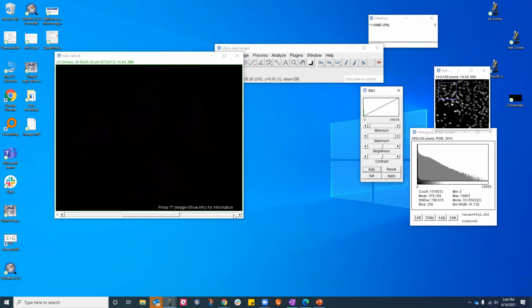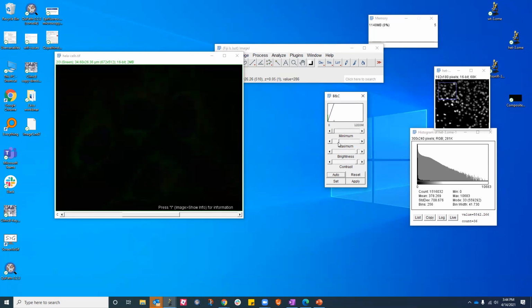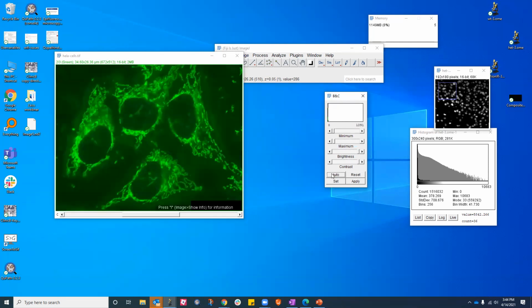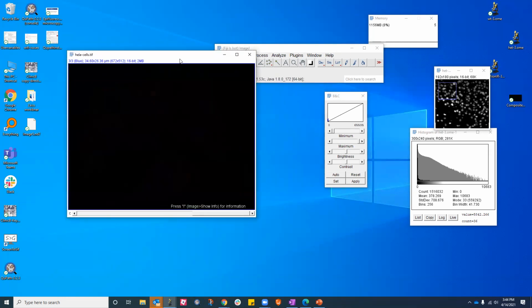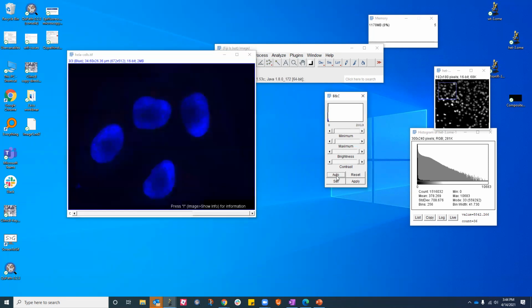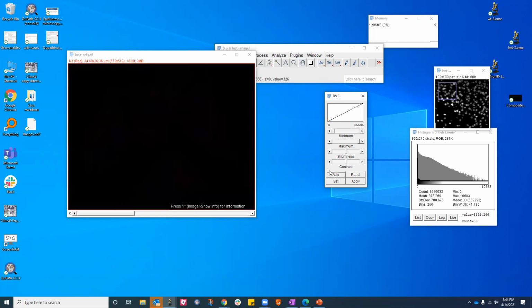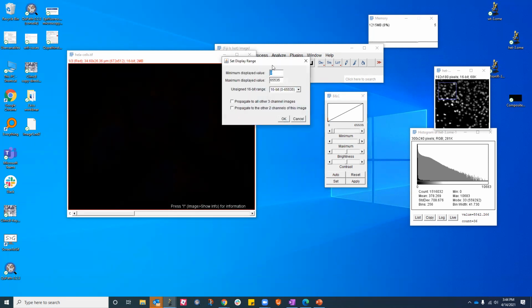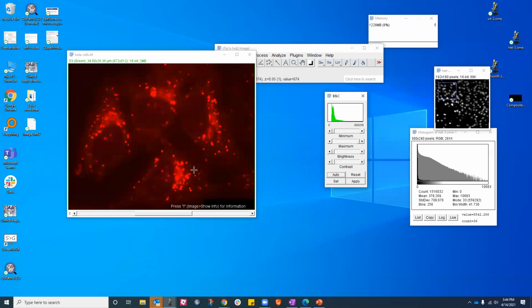That's not because there is nothing in the image, it's just because the display is different. Okay. So I can just click auto, go to the next image, and again I'm using the arrow keys on the keyboard to shift between images and just say auto. Okay. It's been stubborn, so I'll just say automatic to make life easy. Okay, and now it's fine.